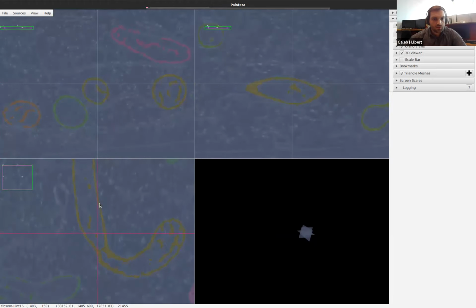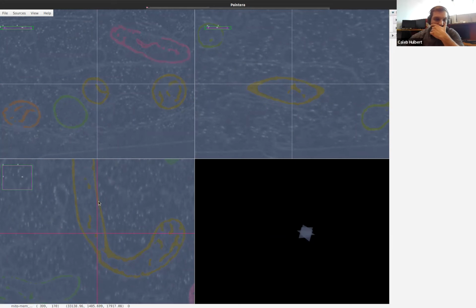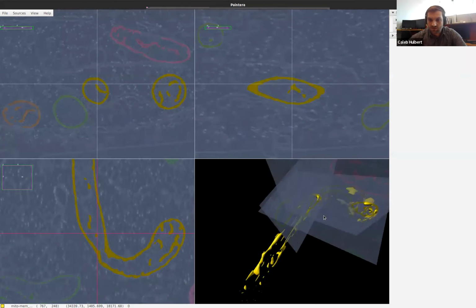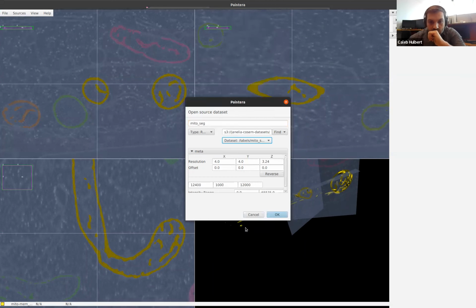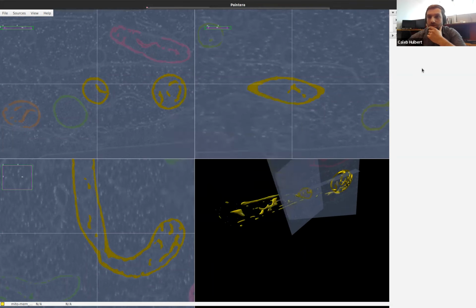This is interesting. So one thing you can do, as Alyson said, you go over here to your sources, you can click on the source and you can select it. Let me zoom in. So you can see, I guess I selected the membrane specifically, so that's why it's a little interesting in this. As a matter of fact, maybe I'll open a different source of mitoseg, the entire segmentation. It just looks a little cleaner. Let me get rid of this one. This is how you remove the source.